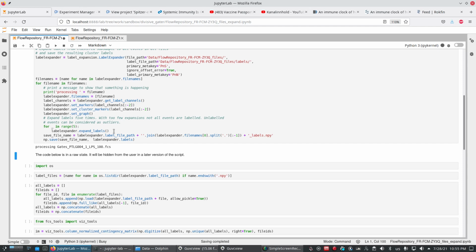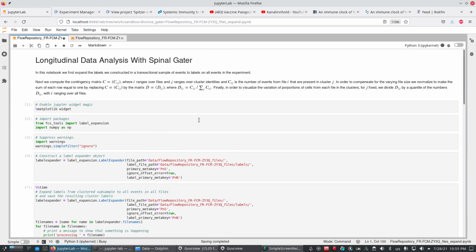Yeah, so what else do I want to say? I have explained that I have some math up here that takes into account that FCS files don't all have the same size.